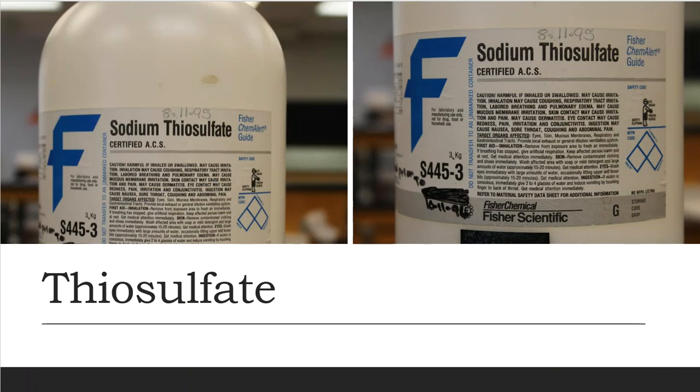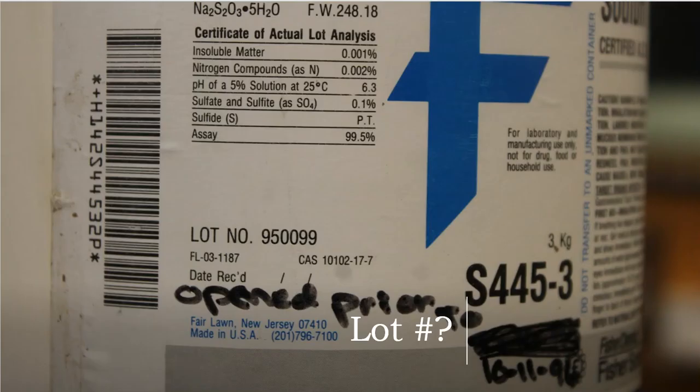The next part of the lab procedure tells me to grab some sodium thiosulfate. So that's what I decide to do. I'll get some sodium thiosulfate. Fisher Scientific is the company. And here's just a larger picture of the label. If you want to know the lot number, you can find it here on the side of the label.